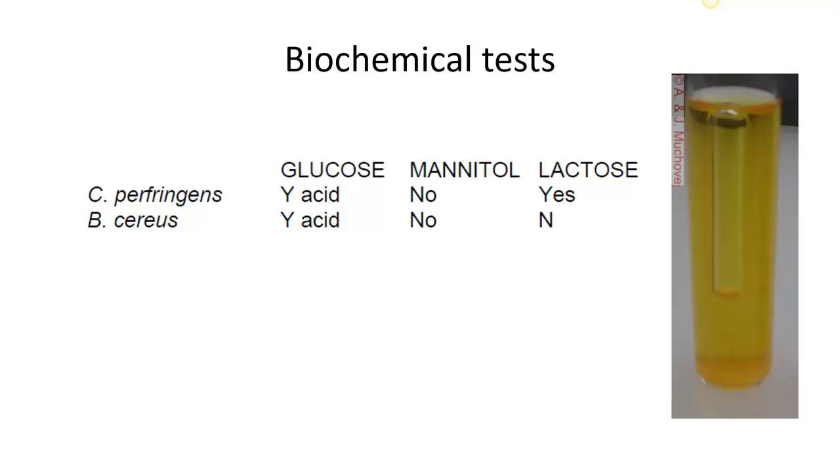Now, there are a lot of different scenarios we could do like this and a lot of different biochemical tests. This is kind of one of the easy ones. It gives you a feel on how we can differentiate between things based on symptomology and the way we look at them. So, food micro looked at through symptomology in food poisoning.